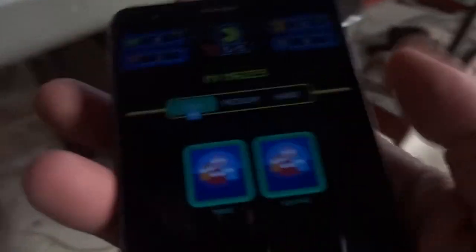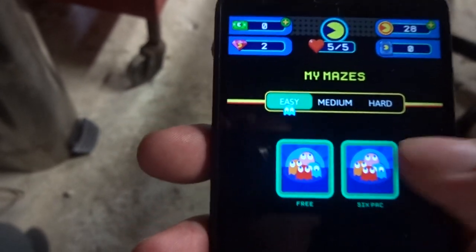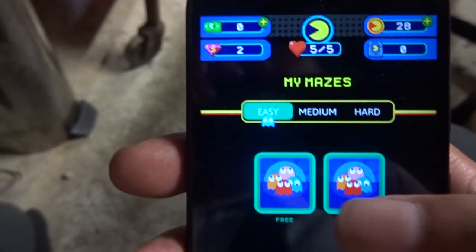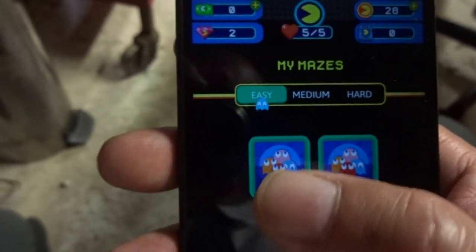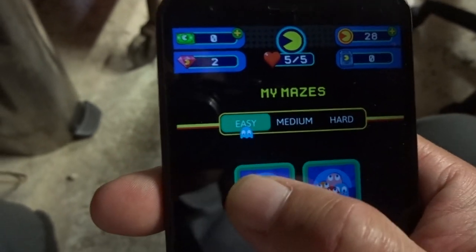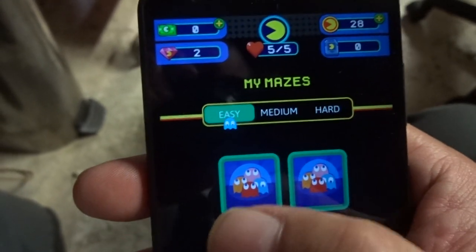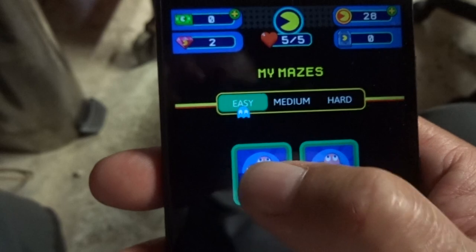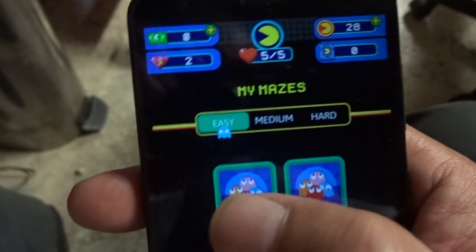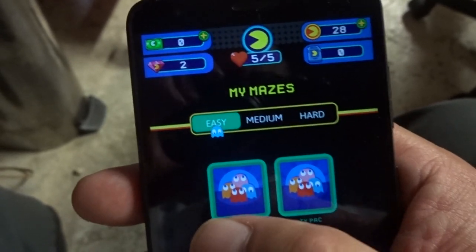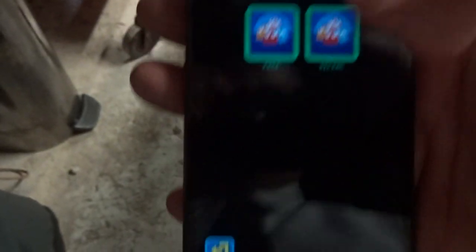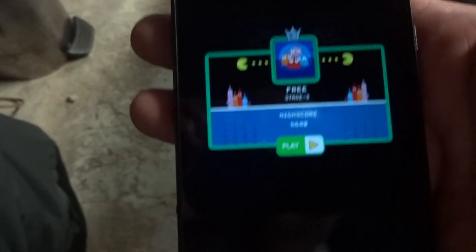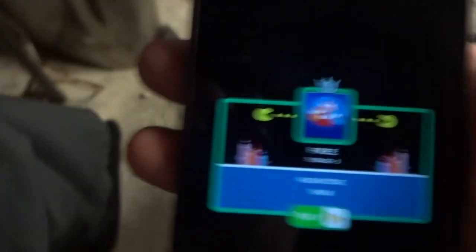I'm going to turn on Pac-Man with the volume down so I don't blow any copyright issues. This is Pac-Man on my cell phone. Now, I'll look at this under the microscope.